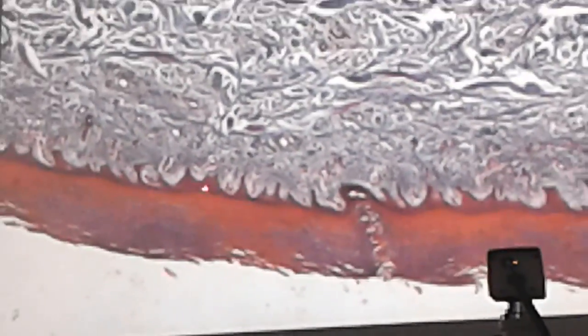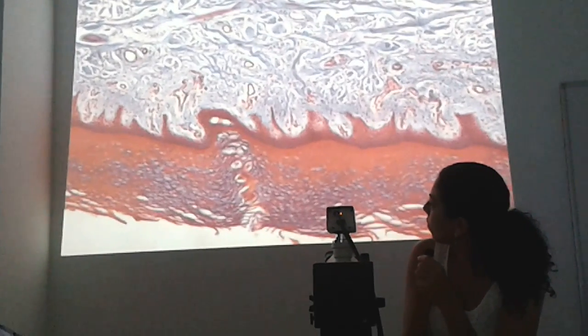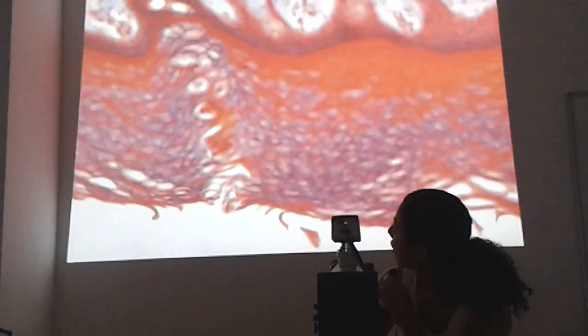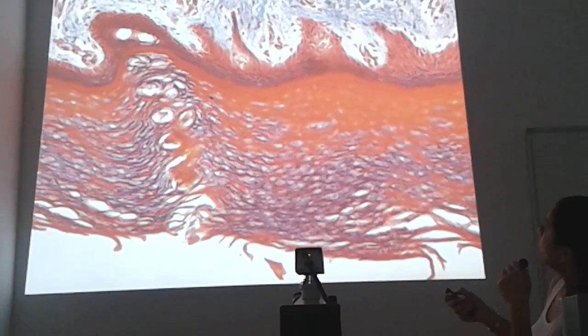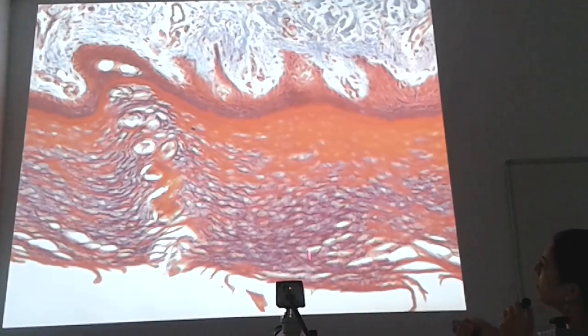These cells are proliferated, but when you look here, in the sole of the skin, this keratin layer is apparent. Let's magnify our image. I'll further magnify it. So this part is the epithelium, and this part from here to here is the keratinized epithelium.